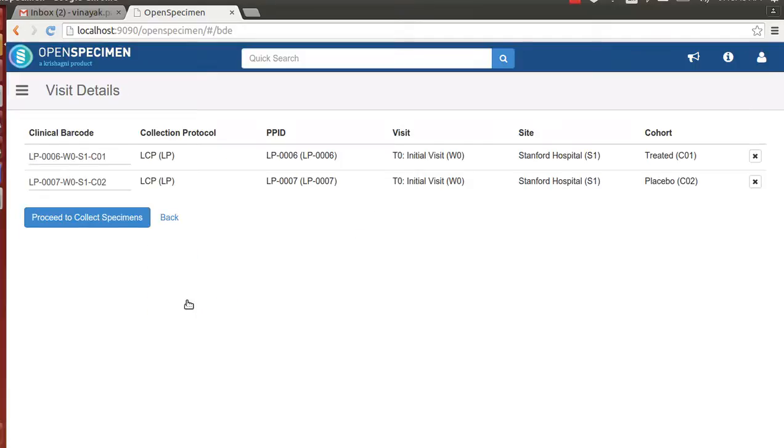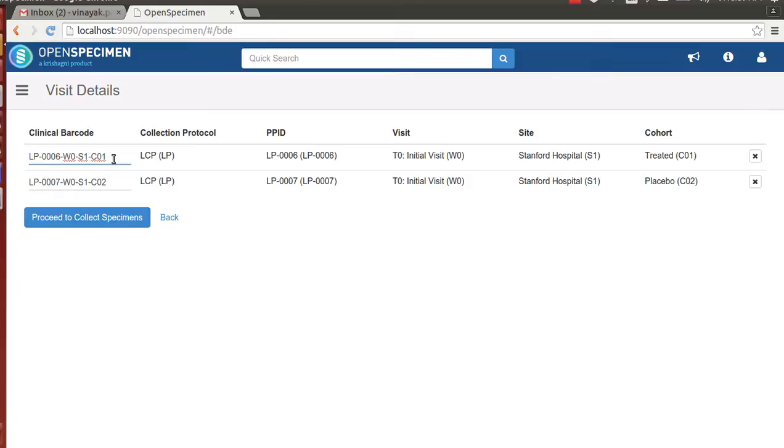The application breaks down the clinical barcode into individual components and presents the details of those components to the technician for review purpose. The clinical barcodes are totally customizable. The format and the components that make up the barcode are completely configurable.